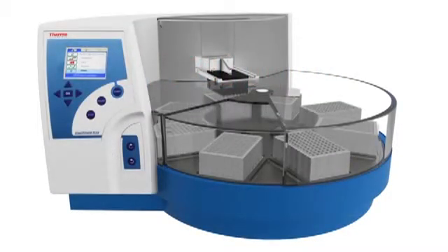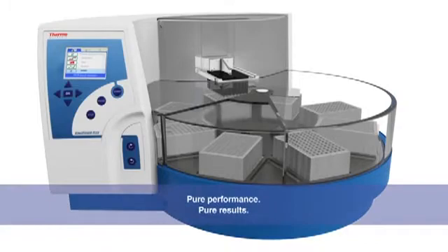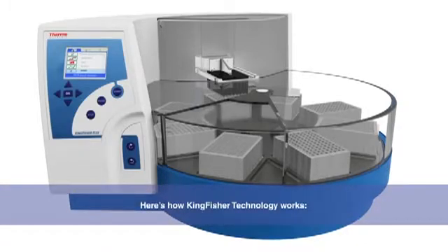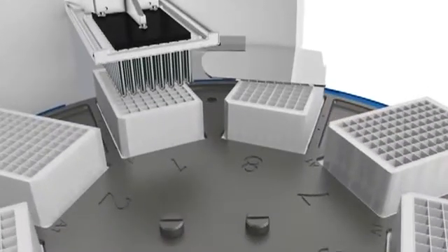Introducing the Thermoscientific Kingfisher Purification System, a unique patented technology. Sample purification made simple. Let's take a look inside the Thermoscientific Kingfisher Flex instrument, a high-throughput solution that can process up to 96 samples at one time. The same technology demonstrated here is used across the entire Kingfisher family.